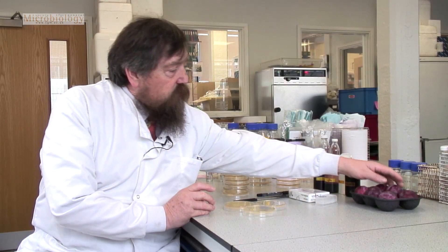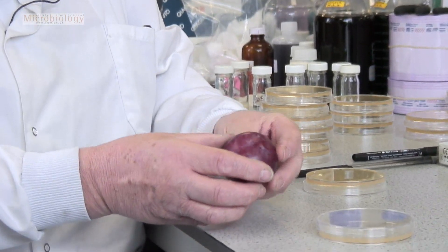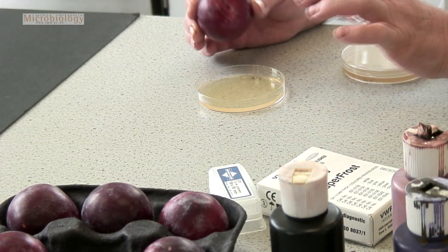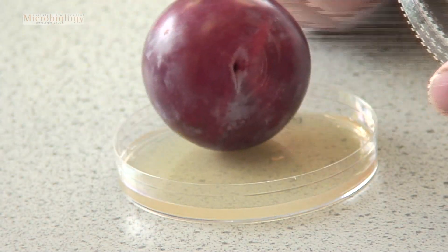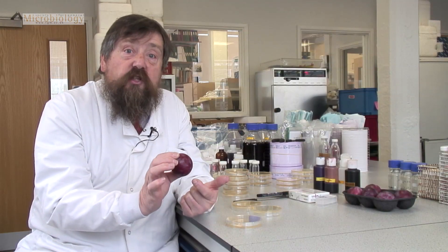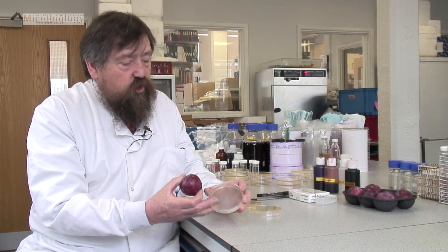Yeasts are everywhere, and if I look very carefully at these plums I can see that on the surface they're looking slightly milky in places. The milkiness is due to the growth of microorganisms. I now need to roll that plum very carefully onto some special jelly — a jelly that contains nutrients that will grow the microorganisms. I'm hoping that the microorganisms on the surface of the plum will now be transferred to the surface of this jelly.